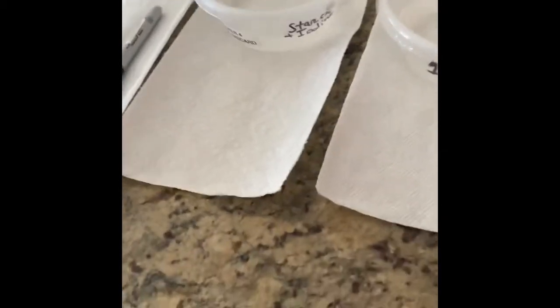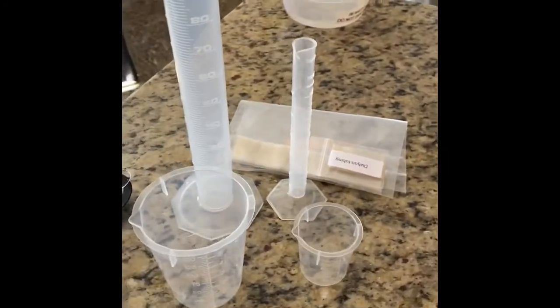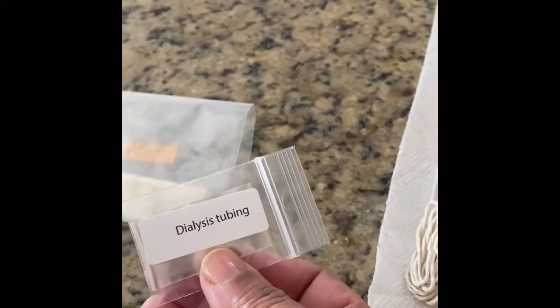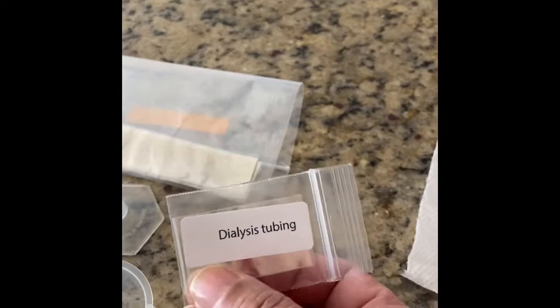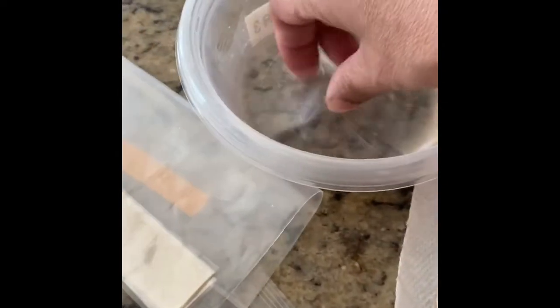As materials, of course, we need different measuring cups, beakers, and just in case, some safety gloves. We need the dialysis bags, which is the tubing. You can find that tubing anywhere, even in Walmart. Those tubing, I put them here.